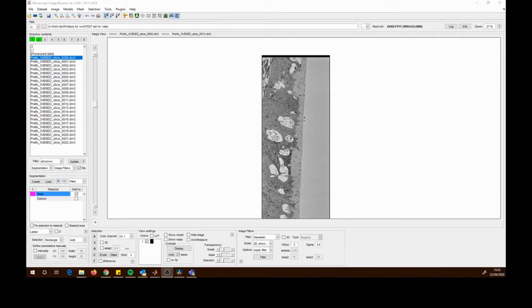So after you've completed the first 3 steps and you have adjusted the contrast, normalized the contrast, then adjusted the contrast after that, then done the alignment, you can then change the image mode for your dataset to say 8-bit rather than 16-bit if you want to. This will reduce the size in the memory and when you store the data as well. So it's useful for speeding up operations you run on the dataset, and also for just decreasing the size it's taking up on your hard drive. So I'm going to do that now.